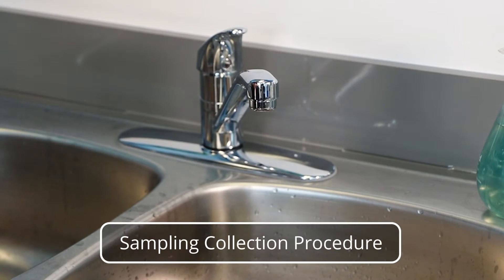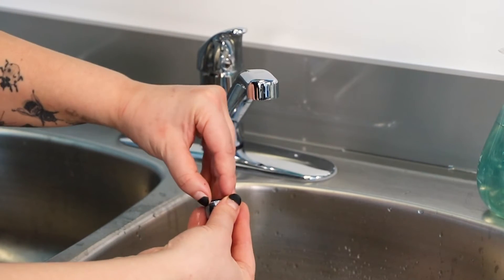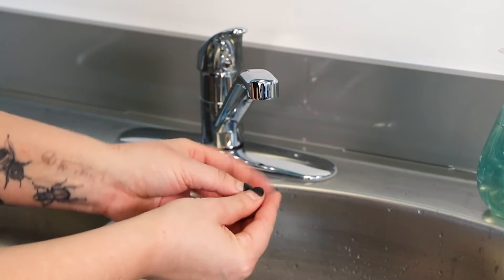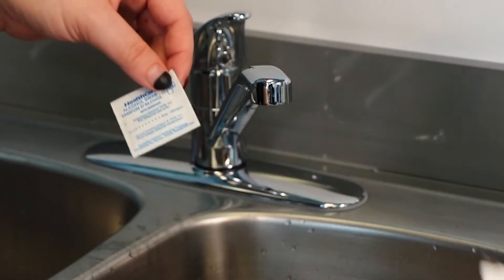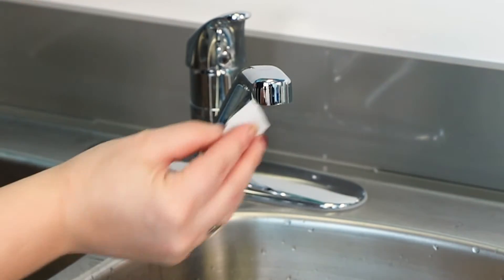Sampling collection procedure: Start by removing any attachments on the faucet, for example aerators, water purification devices, screens, etc. Be sure to check for any O-rings or other seals that may remain in the faucet. Disinfect the tap with an alcohol swab or diluted bleach solution of one part household bleach to 10 parts water. Disinfecting the tap with a flame is not recommended as you could damage the faucet.